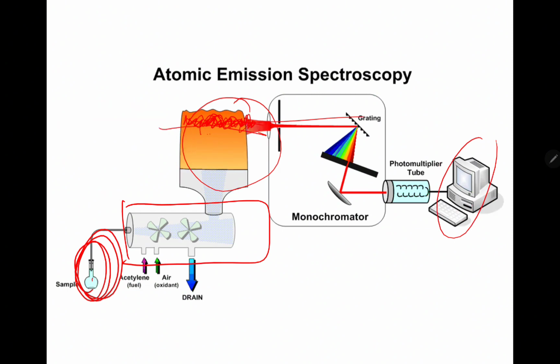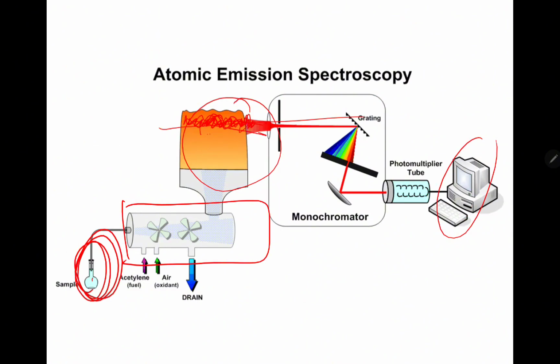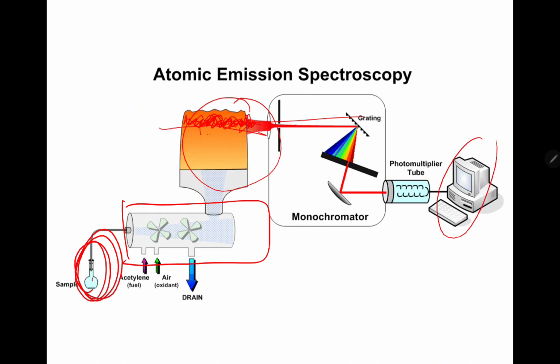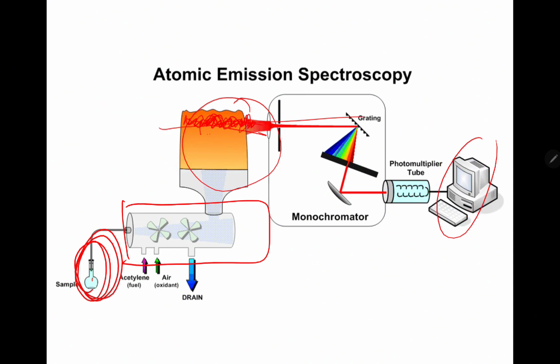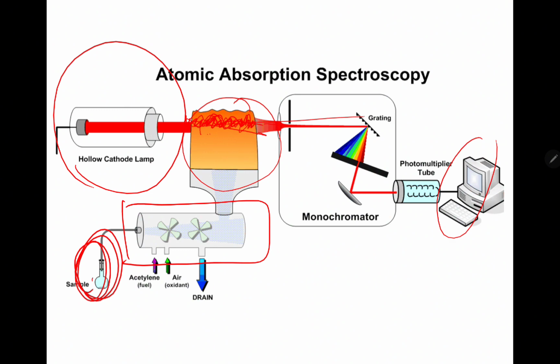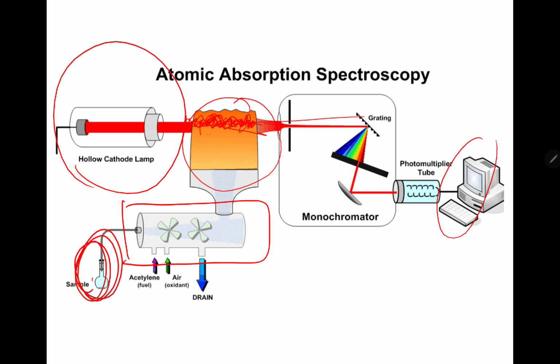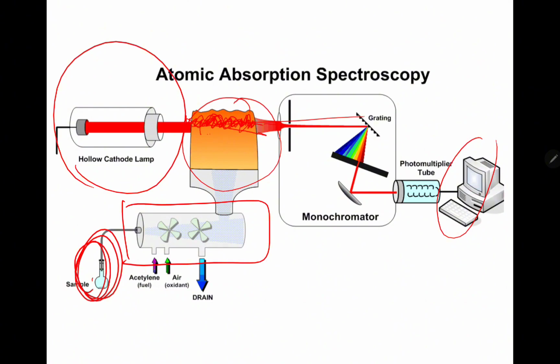Okay? So meron tayong tinatawag na relationship between atomic emission as well as yung ating atomic absorption. Okay? So ang atomic absorption spectrophotometry and atomic emission spectroscopy, meron silang difference. Okay, ang atomic absorption, gumagamit sila ng hollow cathode lamp. Ang atomic emission guys, it uses the same principle but not cathode lamp ang ginagamit nila. Okay, so let's see the relationship between your atomic absorption as well as your flame emission, because diba dito nagagamit din naman ng flame.